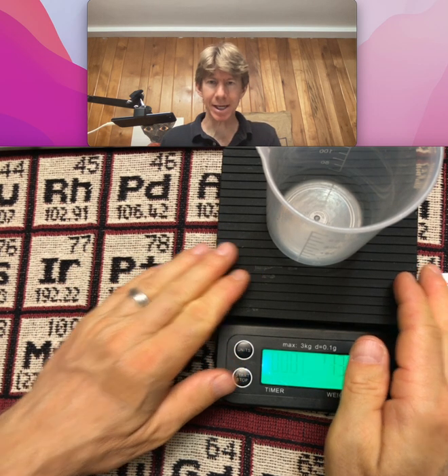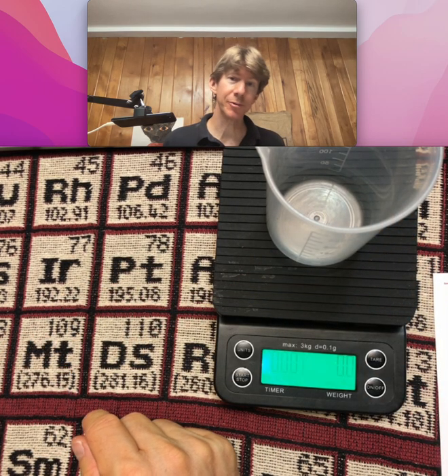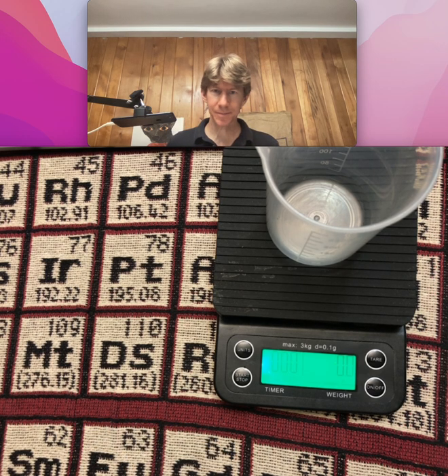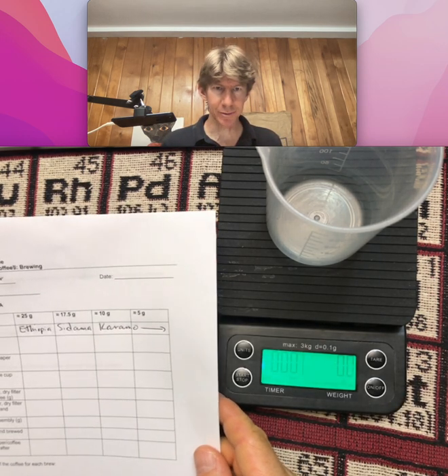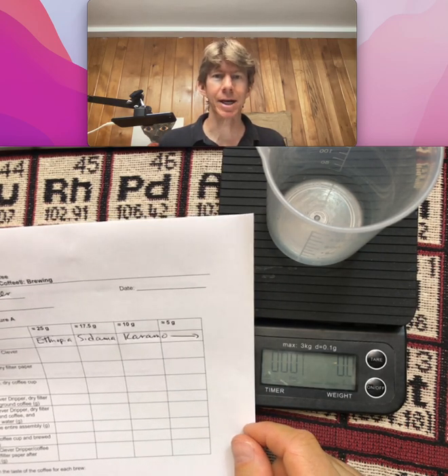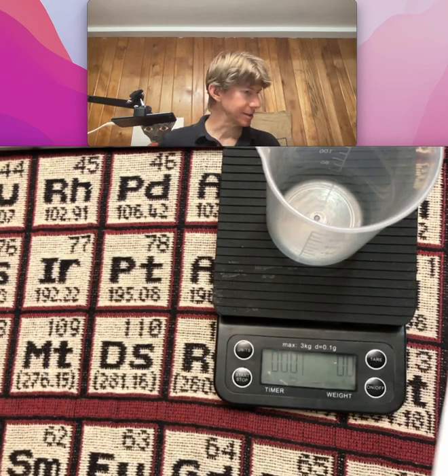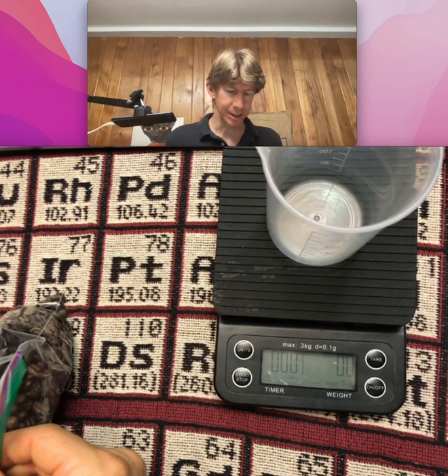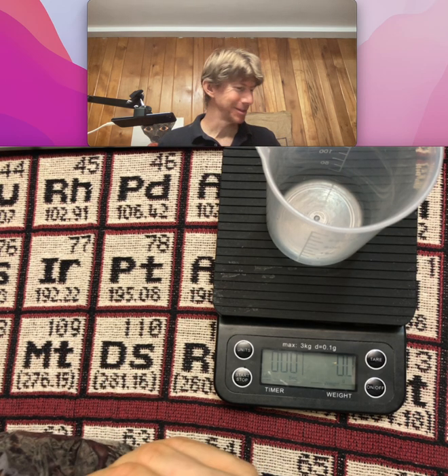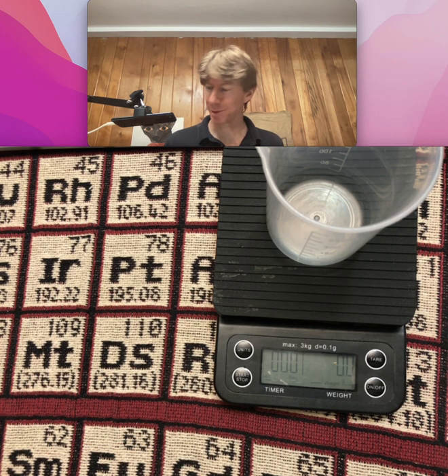You can see my scale, and I've got a 250 milliliter beaker on it. The first instruction is to record the type of coffee you were using, and I've recorded it. It's the Ethiopia Sidama Karamo that I roasted last week — it sure smells good. The roasting in the popcorn popper does well.